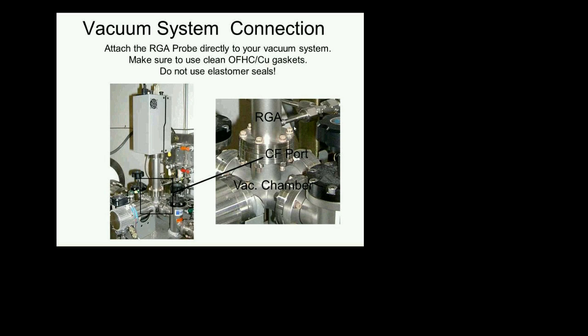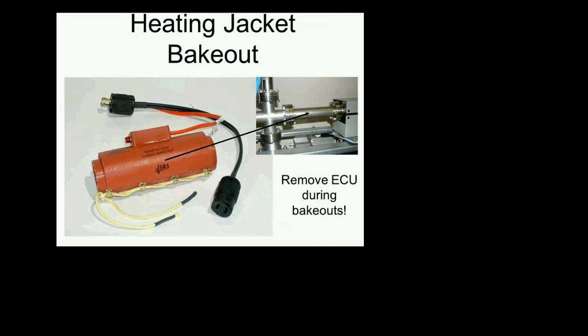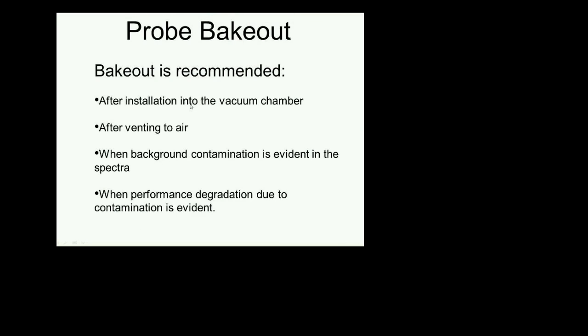And you can buy, I think they're called EVAC, aluminum gaskets that operate just like the rubber gaskets, and they won't outgas and they won't contaminate your spectrum. Does that make sense? Thank you. You bet. Yes, thank you.